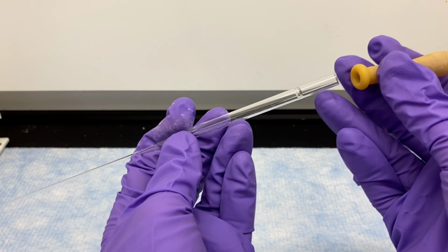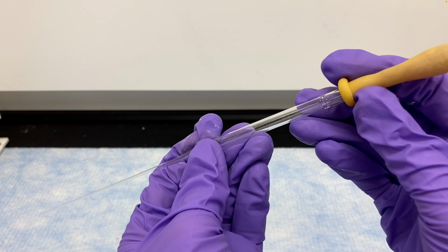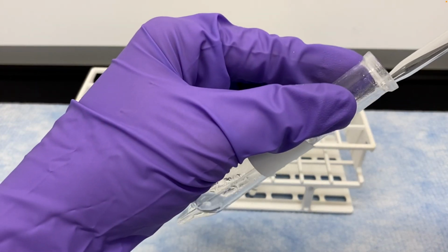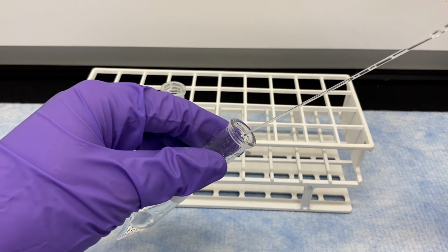If you feel like you can't get all of the water in, you can leave a tiny, tiny bit in. You really want to keep the ethyl acetate in there. You can leave a tiny, tiny bit of water in because we're going to dry the solution twice. So we'll combine the two camphor ethyl acetate solutions just by pipetting one into the other. Both of these just have the ethyl acetate with camphor in them, and you just combine them.